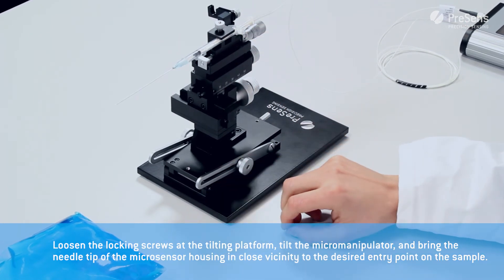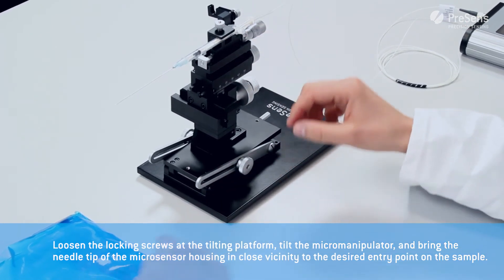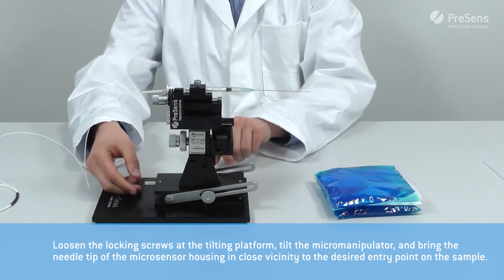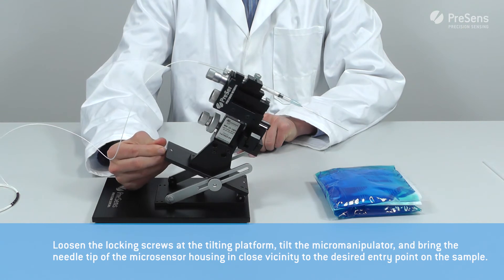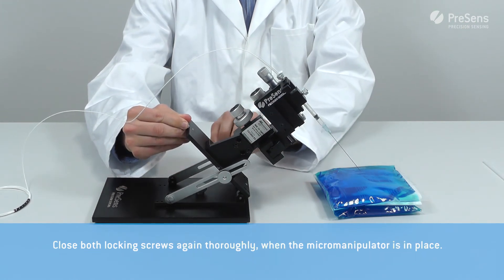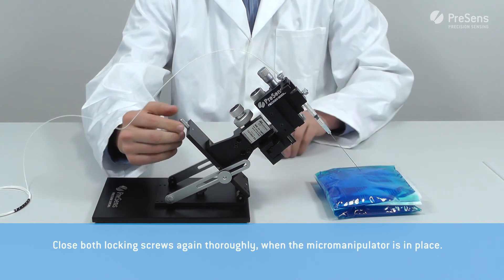Loosen the locking screws at the tilting platform, tilt the micromanipulator and bring the needle tip of the micro sensor housing in close vicinity to the desired entry point on the sample. Close both locking screws again thoroughly when the micromanipulator is in place.